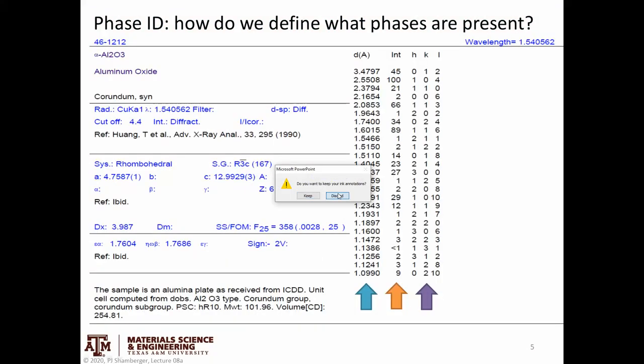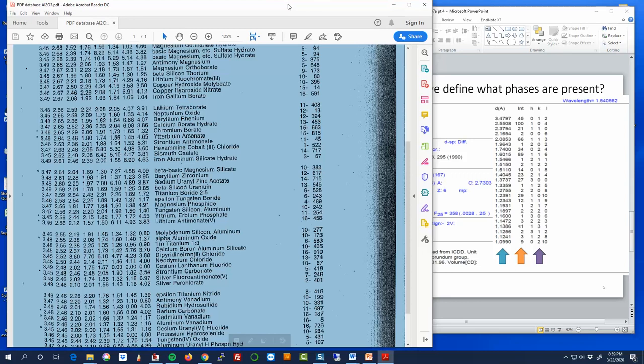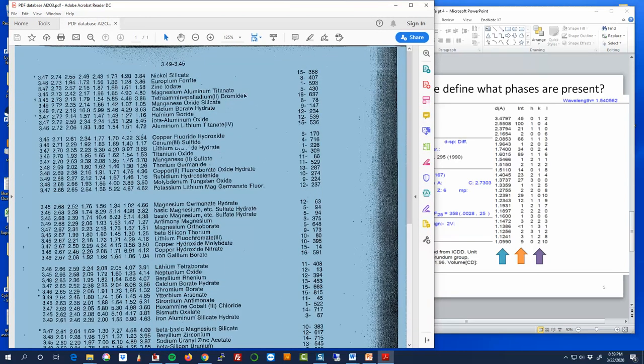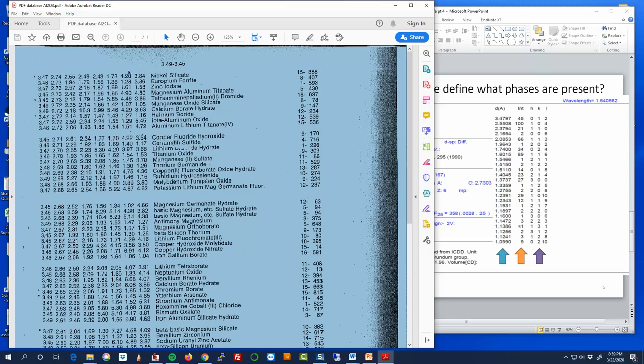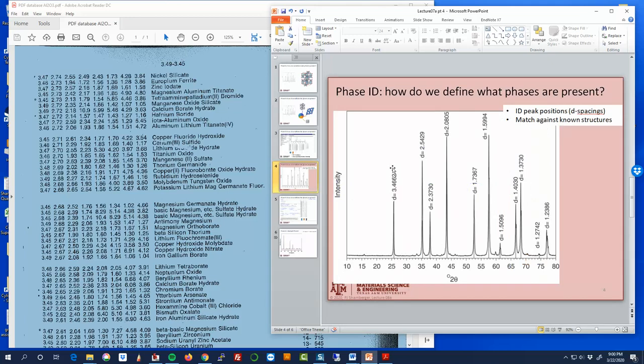This is an example of a page from that book. I have one on my shelf. I don't use it very often because we all use computers now. It's showing different phases, ordered by the first peak you would expect to see, then the second, the third, the fourth, and so on. This page shows samples where that first peak is anywhere between 3.49 and 3.45. Our first peak was at 3.46, so our peak would be somewhere in this range. We have to say plus or minus a few hundredths of an angstrom is acceptable offset.